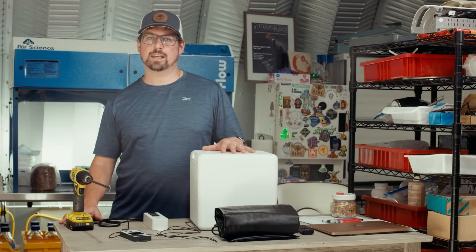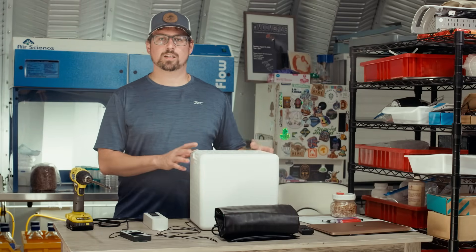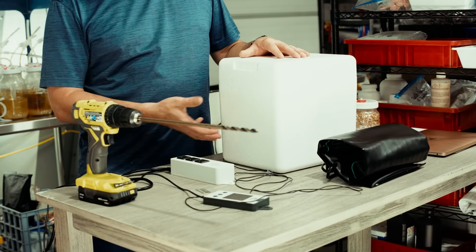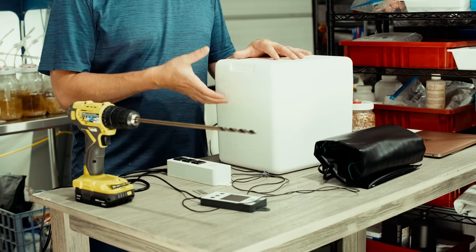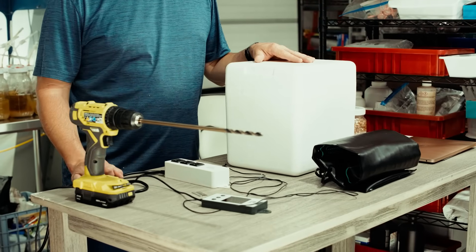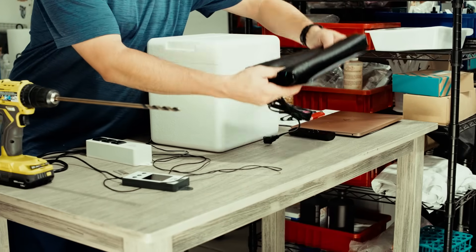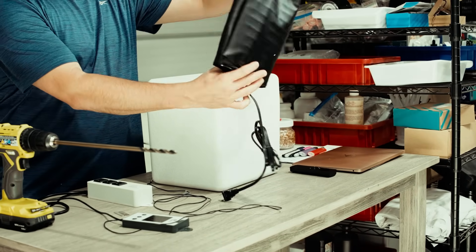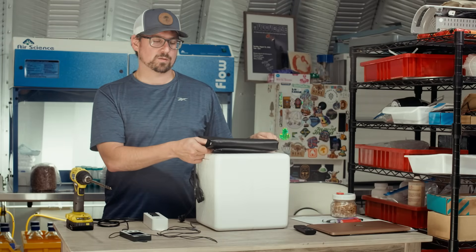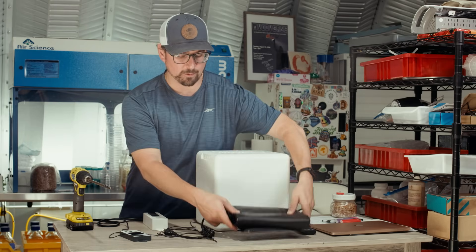The materials you need to make a DIY incubator are a cooler — you can use a number of different sizes. This one fits a couple stacks of petri dishes perfectly, so it's great for transport and makes a nice incubator. The next thing you need is a heating mat. This is a plant starter mat, which is a little overkill, but anything efficient that fits inside is ideal. You can also use reptile heating pads or little heating rocks.